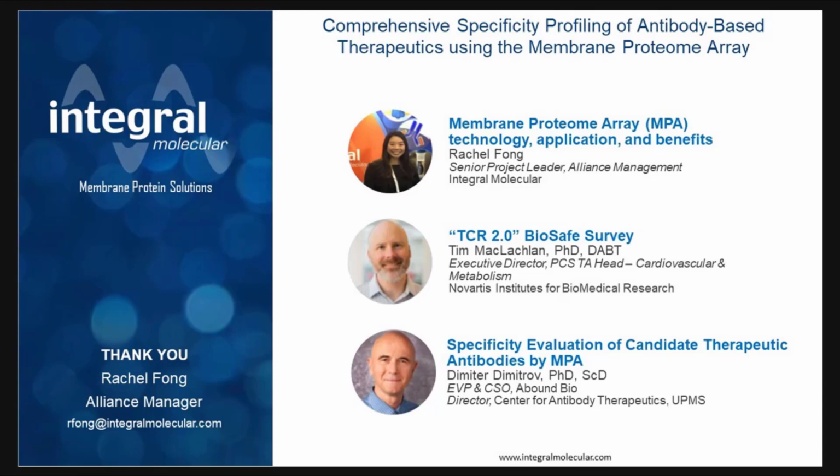Yes, thanks, David. Yes, we can screen non-antibody molecules on the membrane proteome array. The most important thing to keep in mind is whether there is a method to detect that particular molecule by flow cytometry. Since that is our detection platform, there just has to be some way, whether it's directly conjugated with a fluorophore, or if it can be biotinylated or fused to an Fc. Those all will then allow us to perform the detection by flow cytometry.